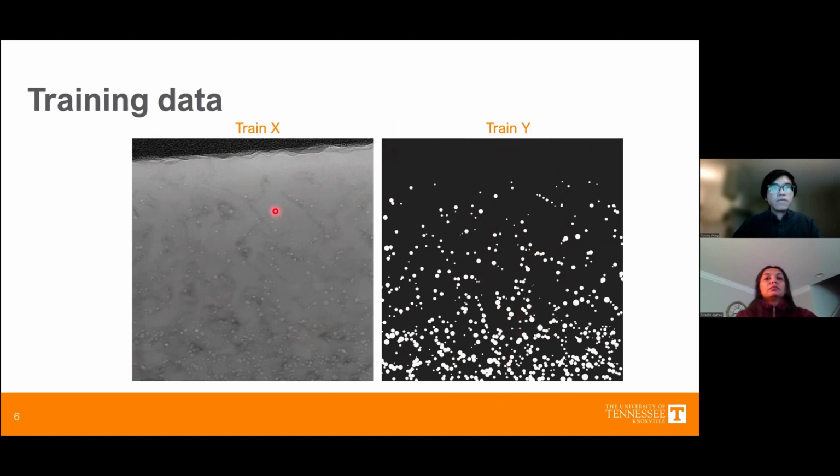And if said image is an image of dislocation loops of different kinds, these loops could have different integer values for different types of dislocation loops in different habit planes.